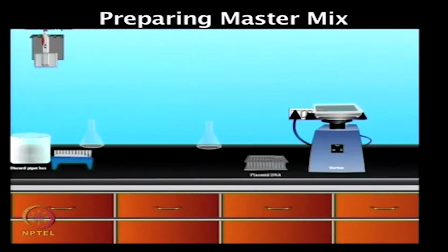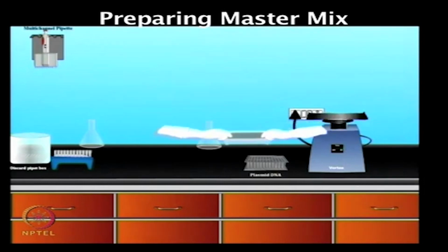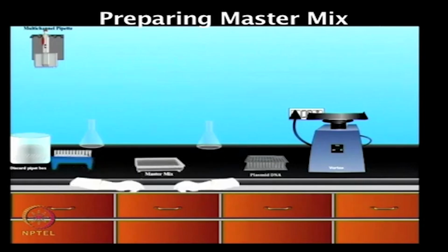Once master mix is prepared, you can mix it well and then transfer 20 microliters of master mix to the block containing plasmid DNA.